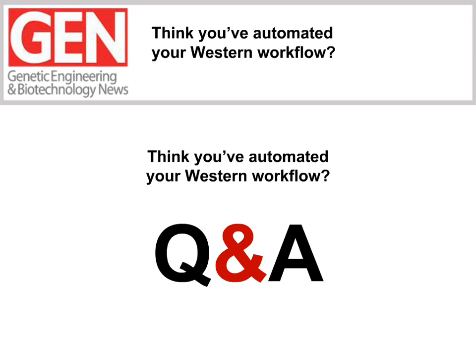All right, Catherine, I have one more question for you. What type of updates do you need to do for different instruments in the workflow, and how does this impact the Mathematica code? Right. So we recently upgraded from a Simon instrument to a Wes, and I actually didn't have to do that much work in order to allow that upgrade to function properly in the system. I created an instrument object that described Wes, including information like the default running parameters that the instrument suggests, and the fact that Wes can have 25 capillaries, whereas Simon can only handle 12.